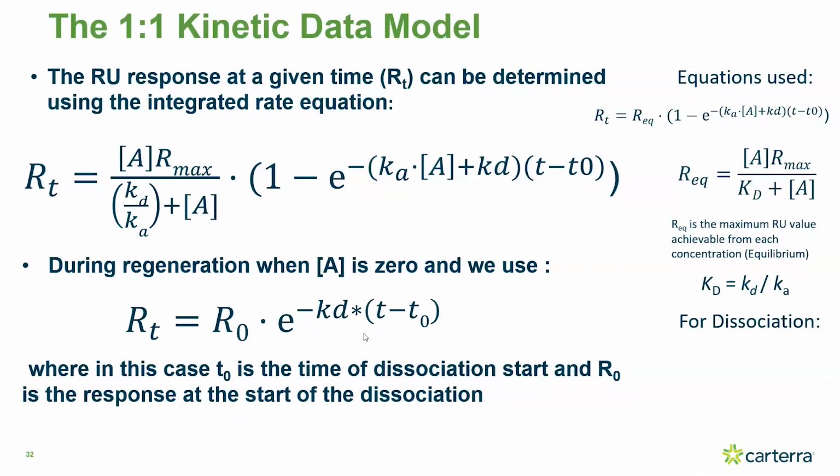So the interesting thing about the off rate is that you can actually measure it from essentially any point in the dissociation. The Rmax, or saturating level of the surface, isn't actually part of that equation. It's often why people would do off-rate screening conventionally, because from any point during that dissociation phase, as long as you're getting enough dissociation and you have a good sense of where your baseline is, you can fit the off-rate.